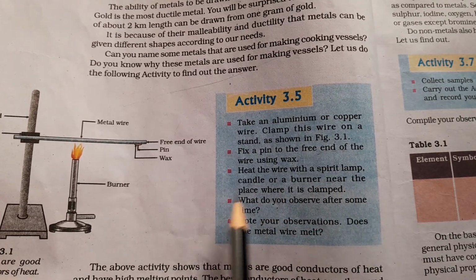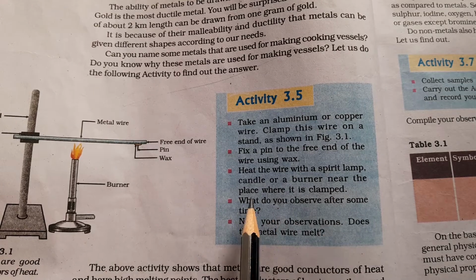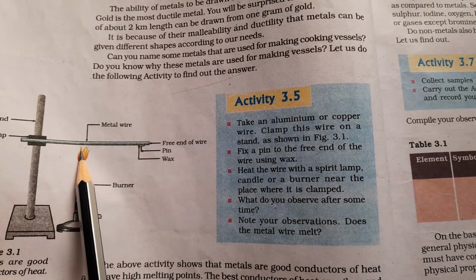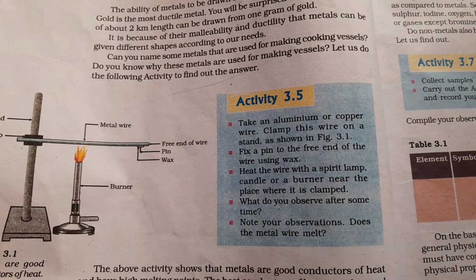Heat the wire with a spirit lamp, candle or burner near the place where it is clamped. Near the place where it is clamped, you are going to heat this wire, okay. What do you observe? Note your observation, okay.